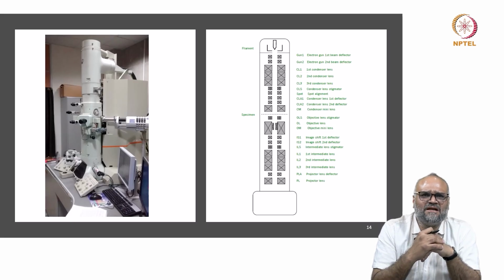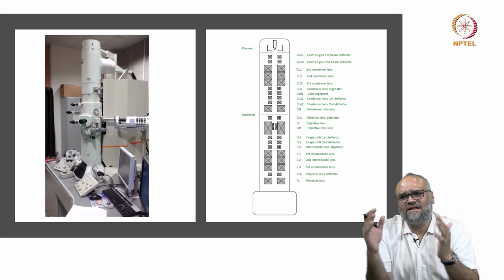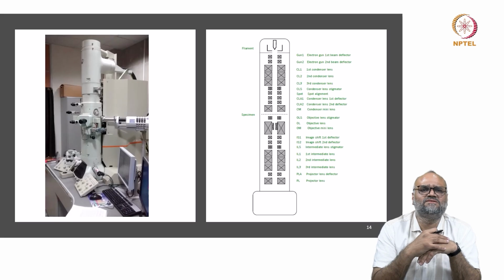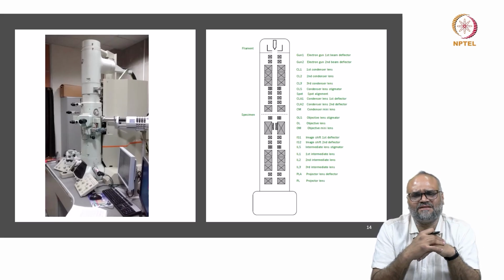Refraction is simply bending of light due to a change in the refractive index. Whereas when you have a charged particle or an electron beam, you have various possibilities which can change the wavelength of the moving electron beam, or deflect or deviate the charged particles, and which can introduce a phase shift in the electron beam propagating direction.